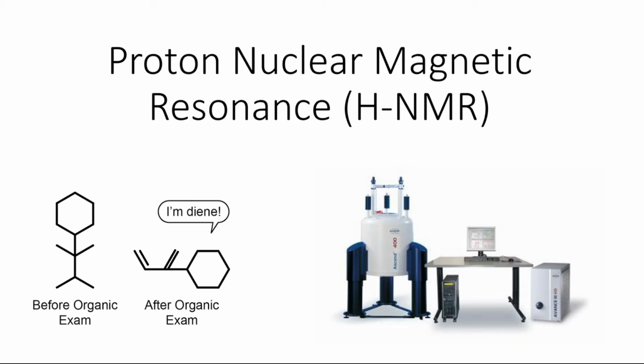Hey everyone, this is Fathema, and here with me today is my student Adam. Hey. And today I'll talk to you guys about how to approach H-NMR questions. So H-NMR, or Proton Nuclear Magnetic Resonance, is a technique that's used to identify the structure of a molecule. So how does it do that?